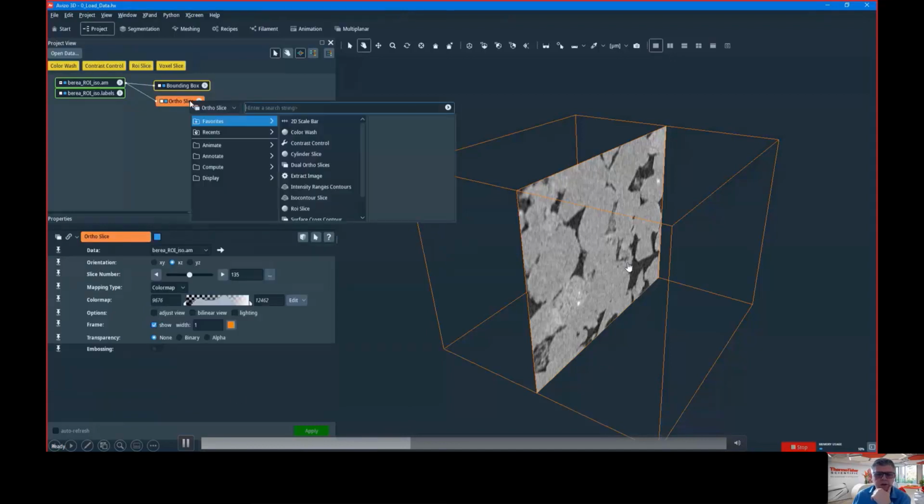I would like to see it here. So how do I do that? You see the other point of Avizo: it doesn't automatically visualize things. It computes, but then the data is here, but I don't see it. So it's up to me to decide how I will visualize it. You will see this is a major difference with PerGeos.